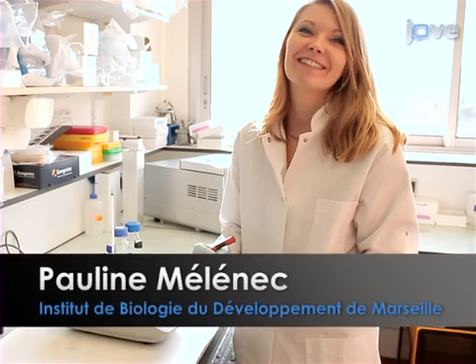Demonstrating the procedure will be Claire Chardès, an engineer from my laboratory, and Pauline Mélénec, an engineer from the laboratory of Vincent Bertrand.